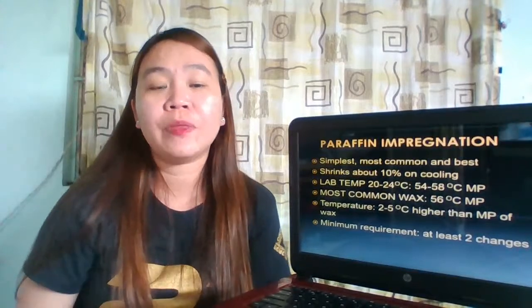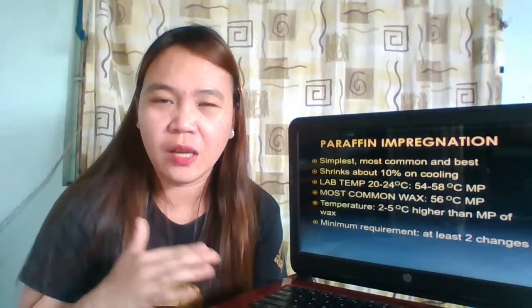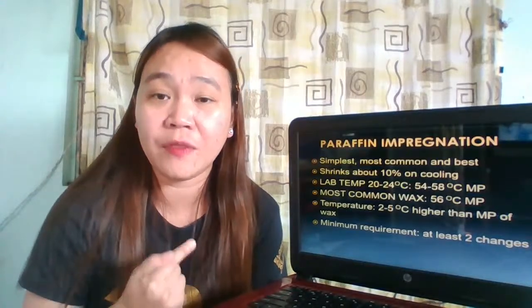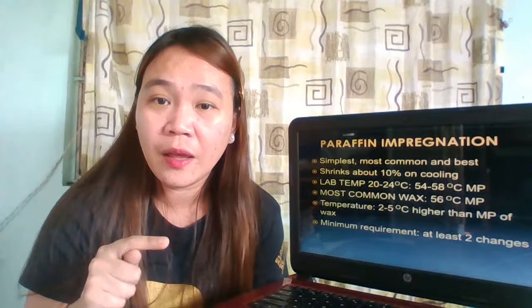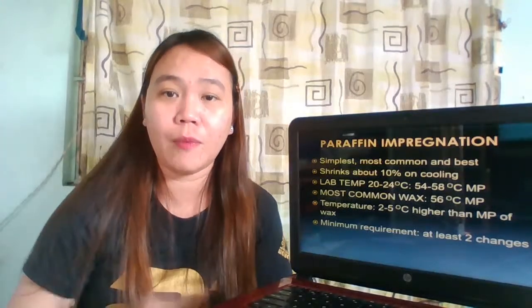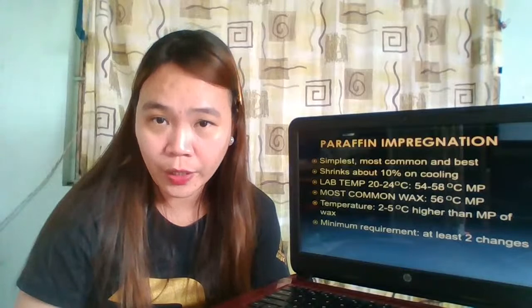So I repeat, the harder the tissue sample, the higher the melting point of your paraffin wax, because high melting point corresponds to a hard paraffin. Harder tissue, higher melting point.